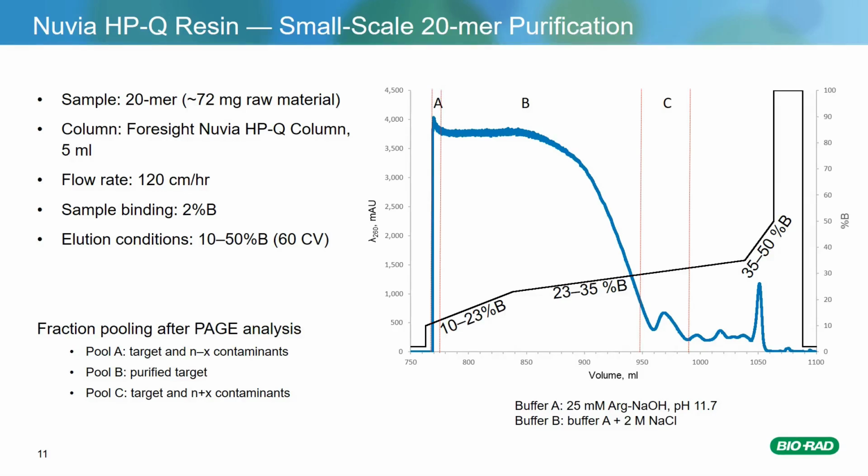And also you'll note on the chromatogram on the right, the slope of the elution was changed during the run, as this showed some impact in the separation between the contaminants. So initially you had a little more broad slope at 10 to 23, then even broader from 23 to 35% B, and then a steep slope from 35 to 50% B.